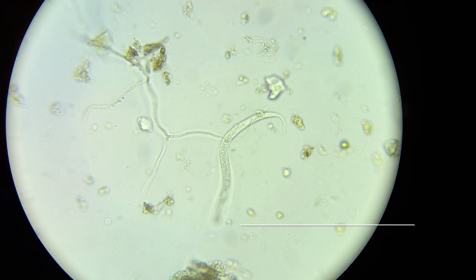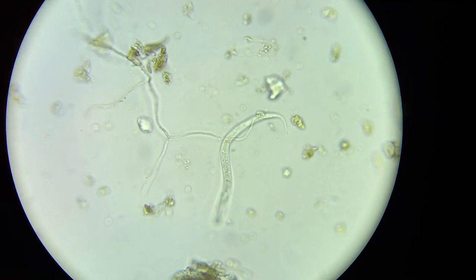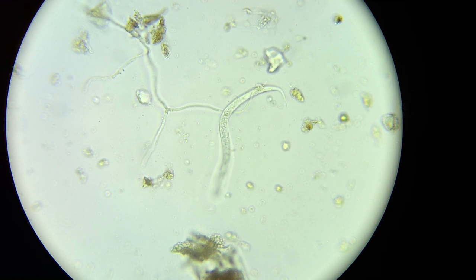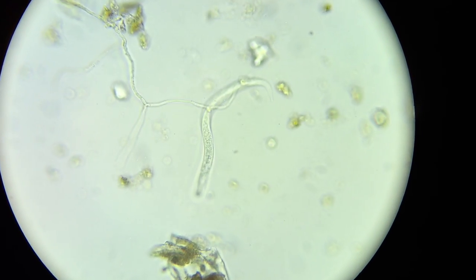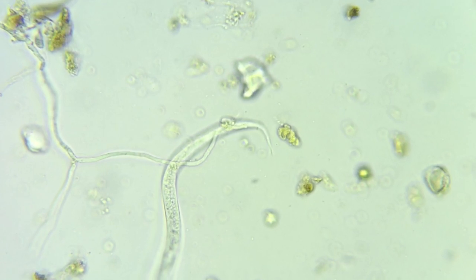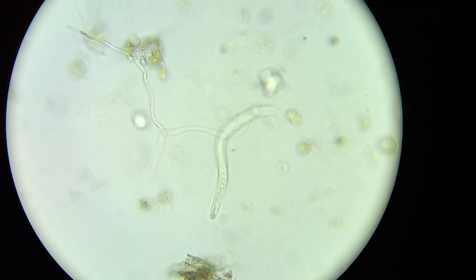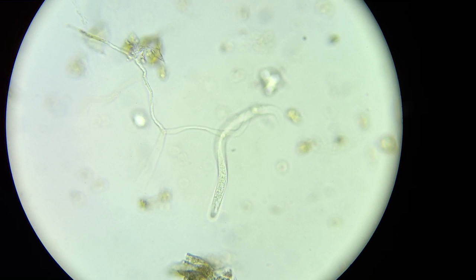This is a really good find — it was worth scouring through this worm compost for sure. I found a nematode, and it looks like a fungal feeder. What's really cool is there's a fungal strand that looks kind of like it's attached to it. Right in the middle of its body and towards the tail are these structures of the fungus that are nematode-capturing bulbs. Some fungi have lassos that catch nematodes, and that's kind of showy and cool.